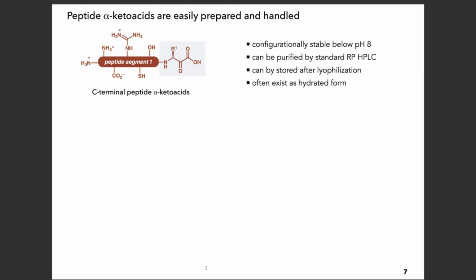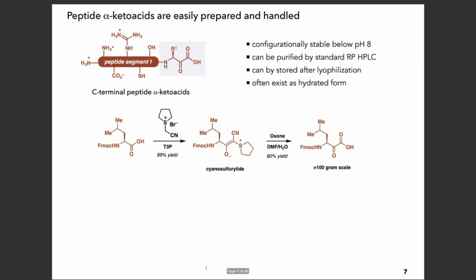They're quite stable. You can treat them just like you do any other peptide. You can purify them by reverse phase HPLC. You can lyophilize them. You can store them. So they're really quite easy to handle. They do not epimerize. You have to really work very hard to epimerize them. The challenge at the beginning was to make them.